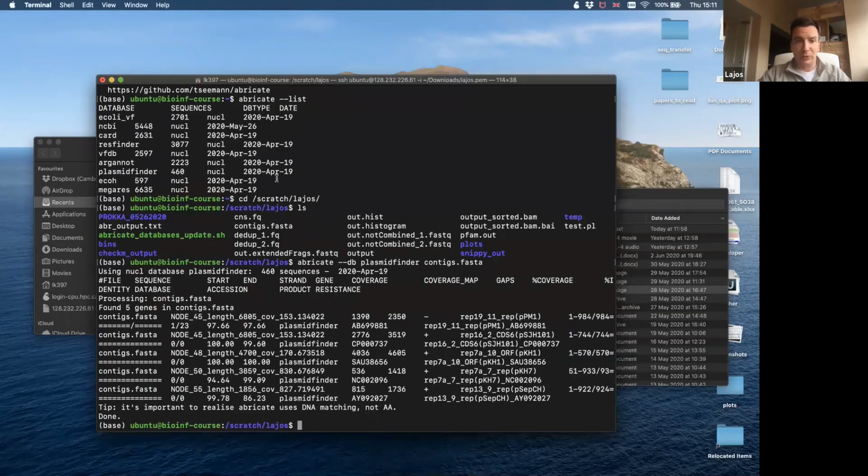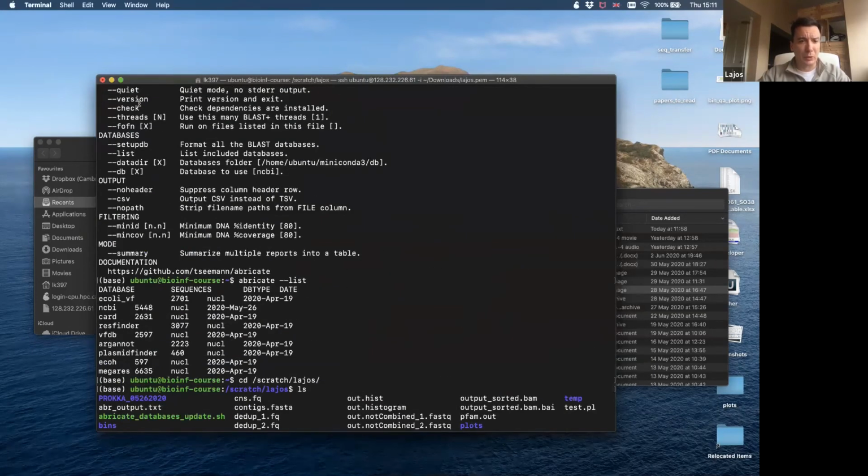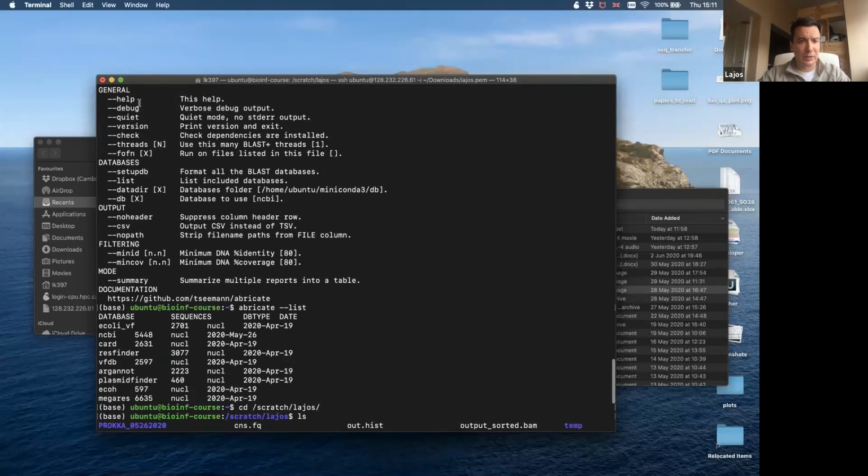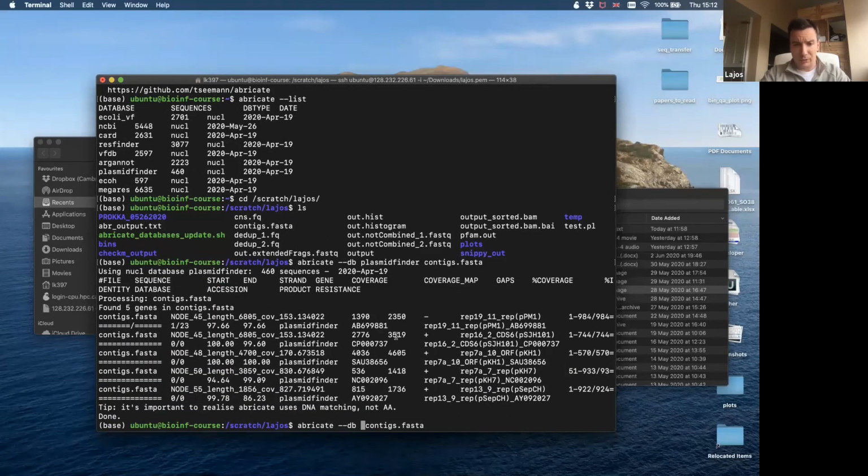If you want to look for virulence genes, then I think it's the VFDB probably. So do the same thing. But again, it's not the same what you will get back. So it's not doing, I don't know if you can ask to do all databases. I don't think so. I don't see that kind of option.